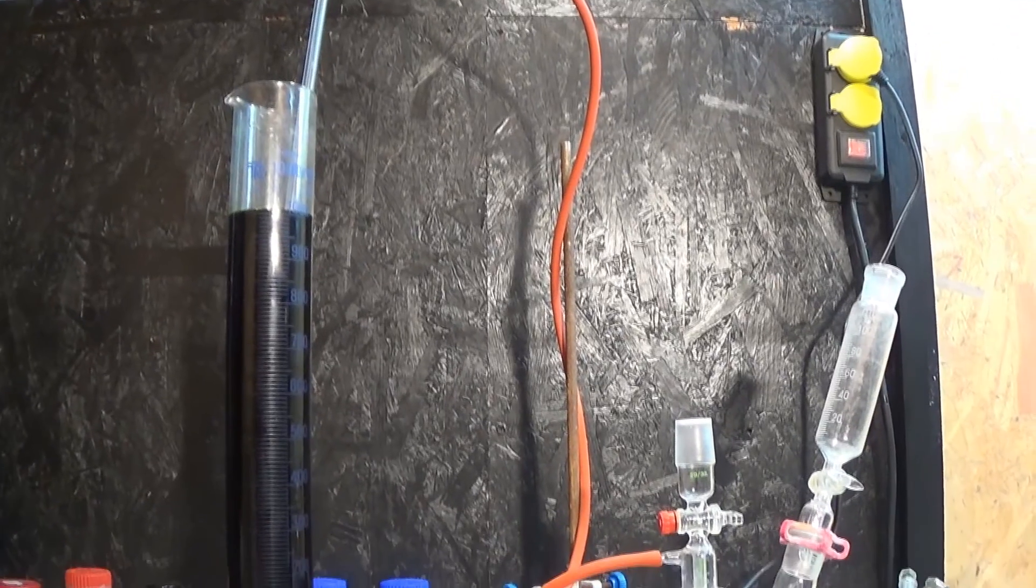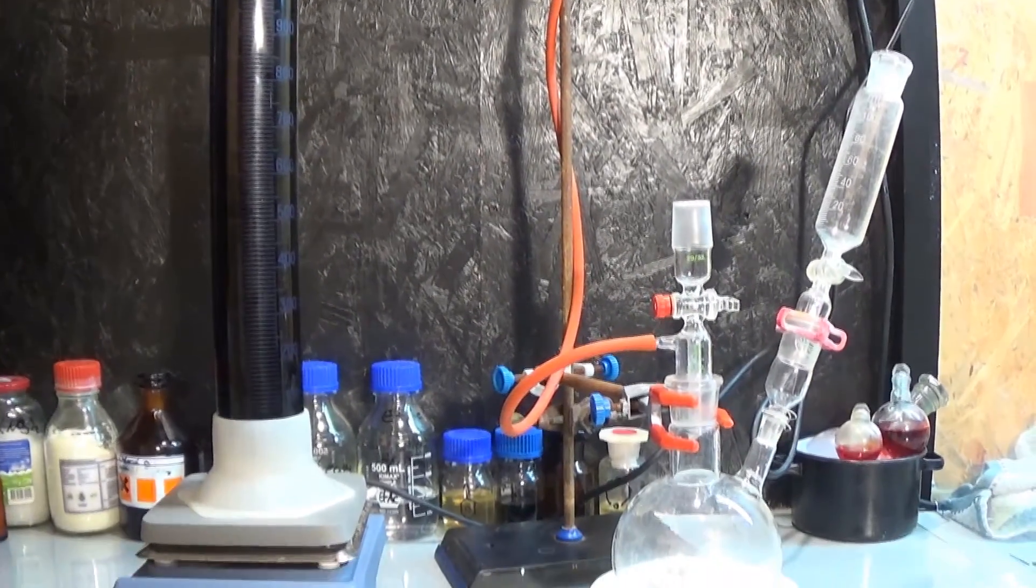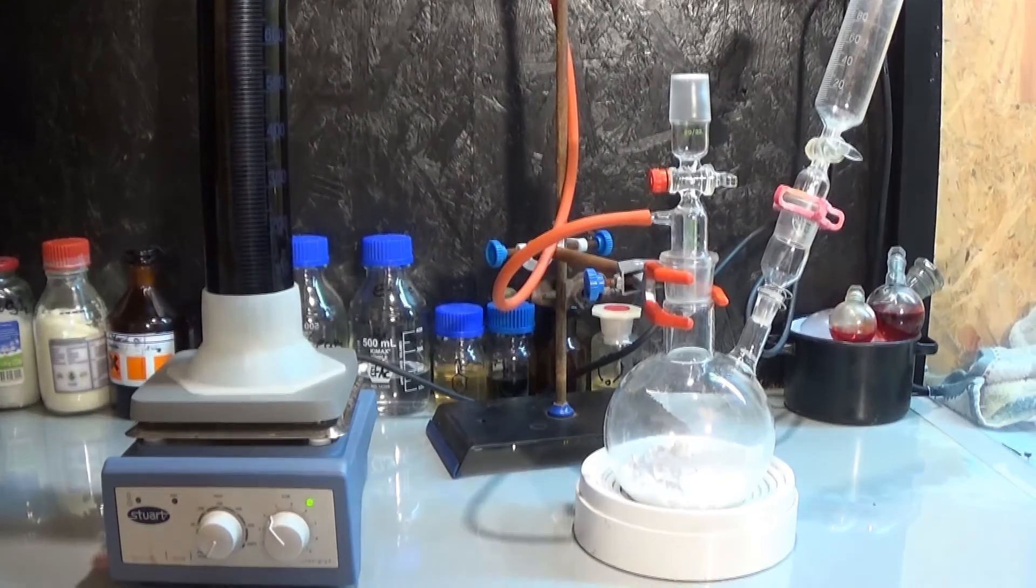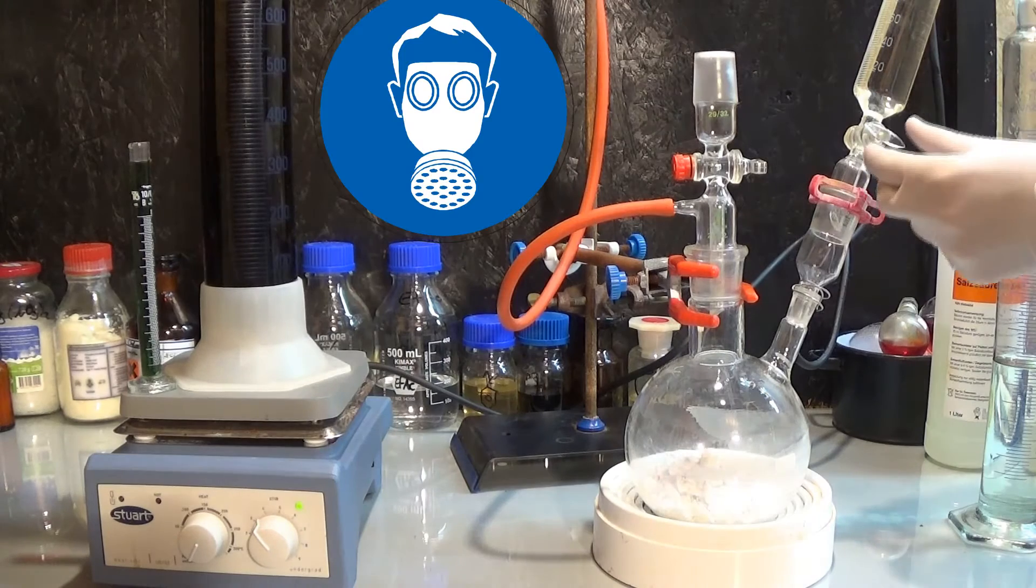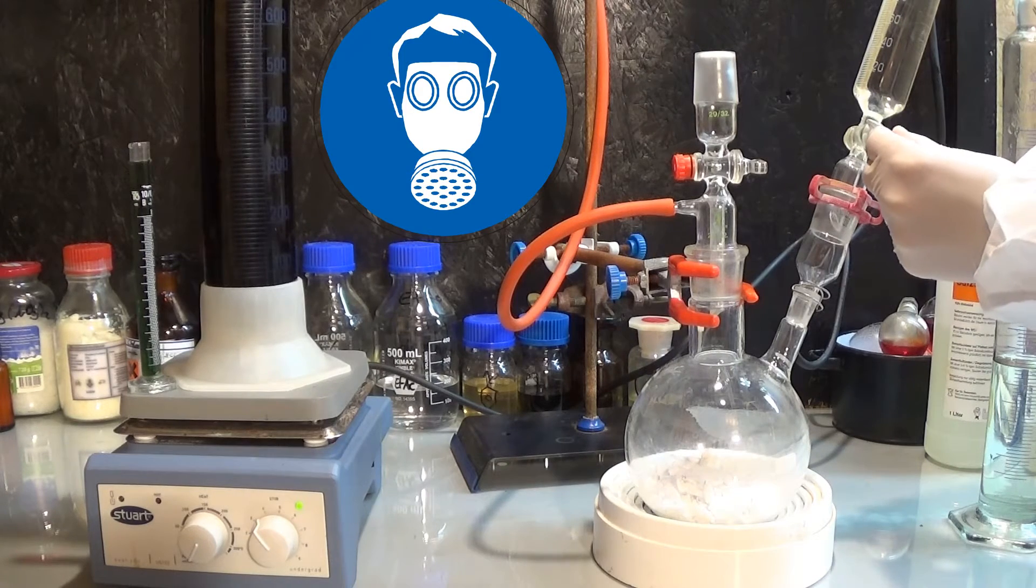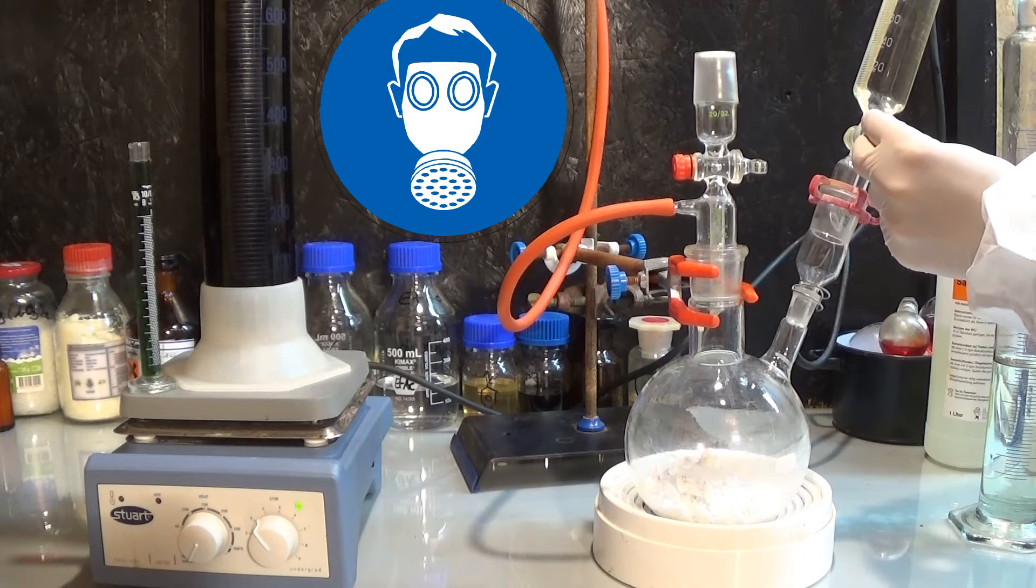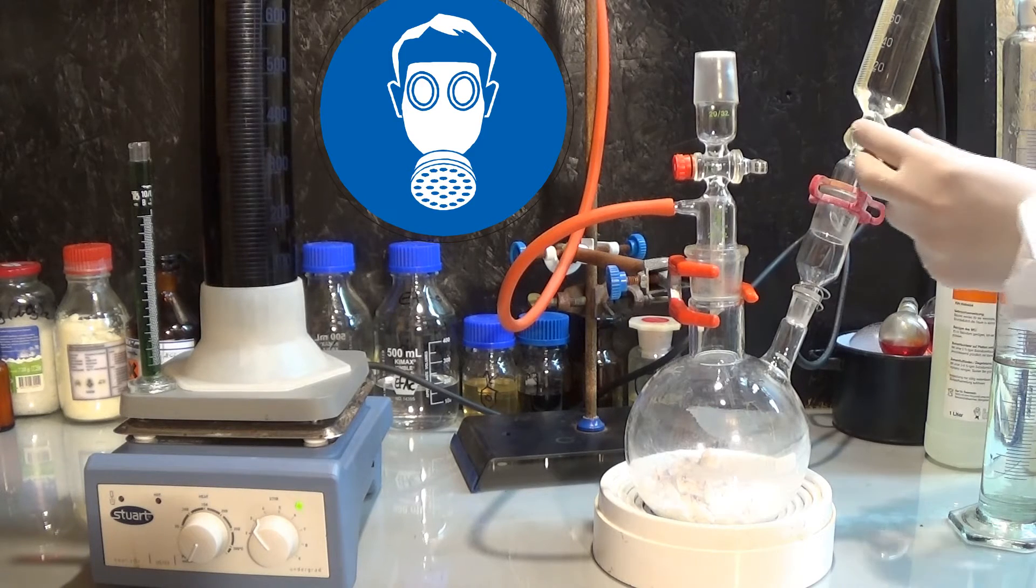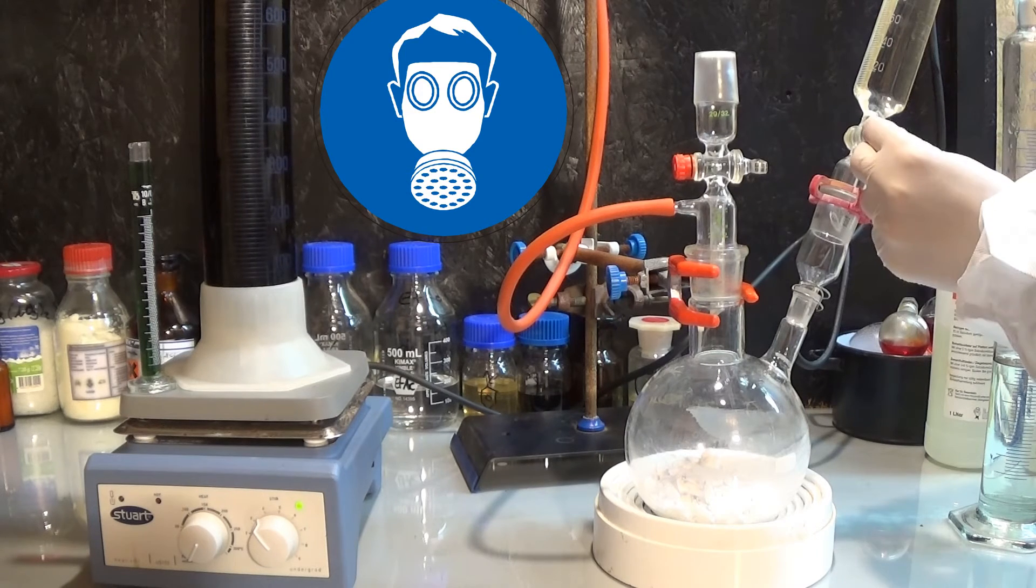So now comes the point where the gas mask is mandatory, and I am not joking—the chlorine can kill you. Now the hydrochloric acid drip rate is adjusted in a manner where only a few bubbles a second are evolved. You really do not want to overshoot because there is no backup containment of extra chlorine gas, so the evolution of it should be slow and steady.